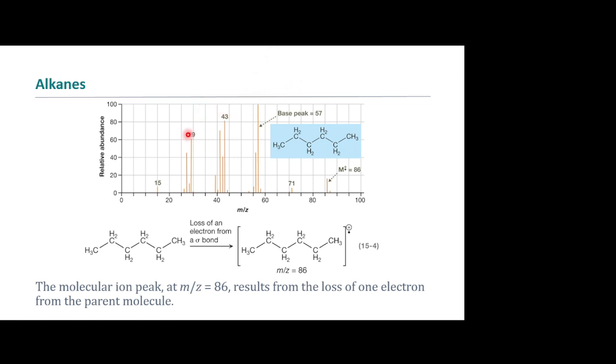What do these ones tell you? Less stable, but still pretty stable, right? This one here, not stable, right? Yeah, definitely not a stable one. And so what we're going to see here is that we get this right here, which is the carbocation on the entire structure. We haven't fragmented it at all. That's the parent molecule, right? These ones down here are going to be fragmentations of that, aren't they? They're going to be where we have parts of this split off because of rearrangements.